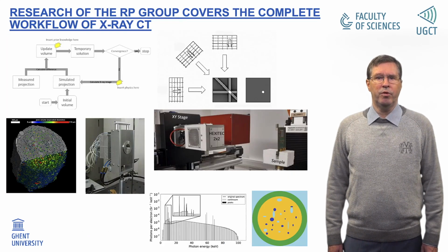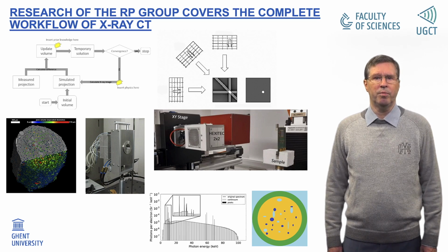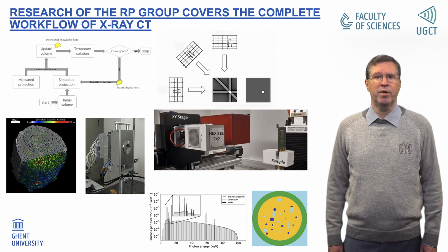Next to scanner development, the research of the Radiation Physics Group covers nearly all aspects of the X-ray CT imaging chain, including physics and instrumentation, new tomographic reconstruction methods, and 3D and 4D analysis methods. My colleagues will now highlight some of these aspects.